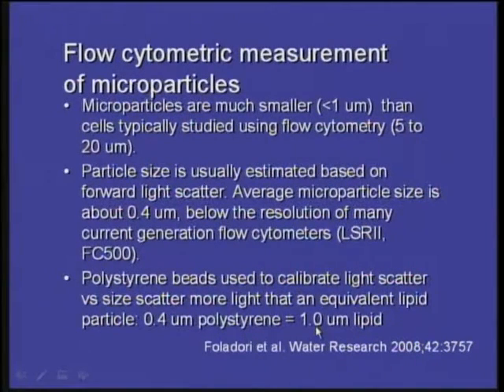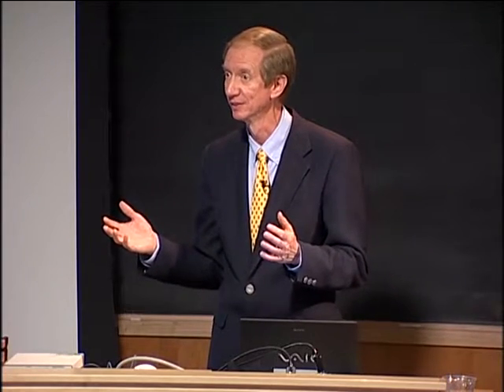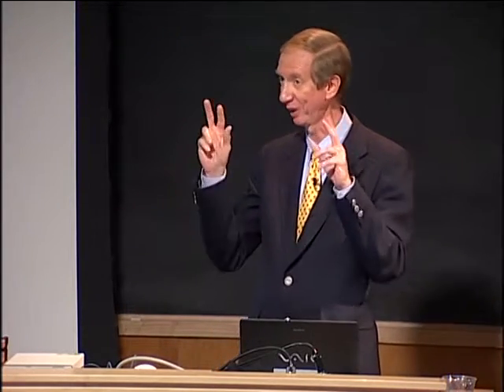So everybody that's been using these gates has actually been looking at microparticles that were a lot larger than they thought, about twice as large. They thought they were looking at 0.5 to 1. They were literally looking at 1 to 2, which means what they were looking at is little platelets. And so guess what? They find lots of platelet microparticles.